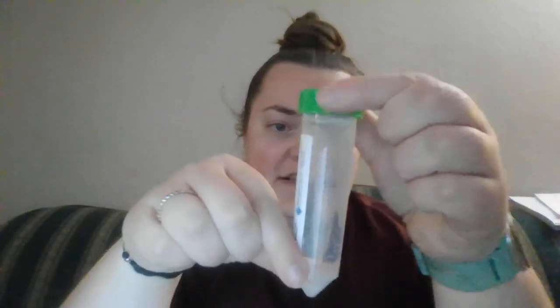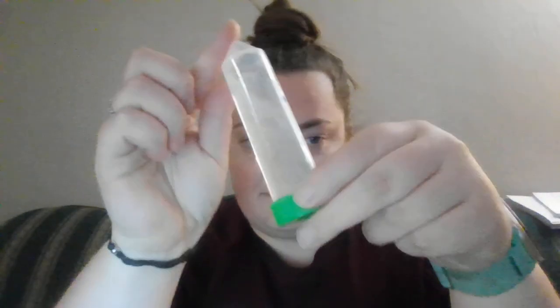So it either needs to be in a solution so that it can be clear, even if it has impurities, or it needs to be something transparent. So you can't test the optics or the polarimetry of a napkin because light cannot pass through it.